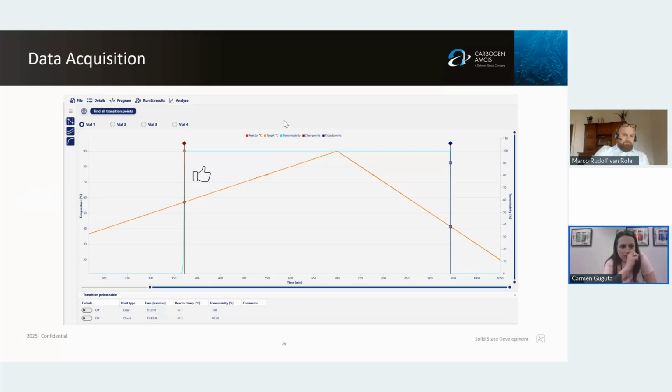I have one more question and a lot of thanks. Do you always perform 3 temperature cycles for your Crystal 16 data acquisition? No, it really depends. If it has to be really quick and dirty, I do just one. I warm up, cool it down, and then take the data as is.